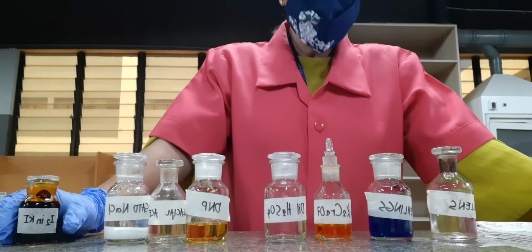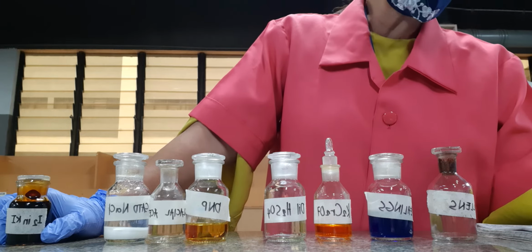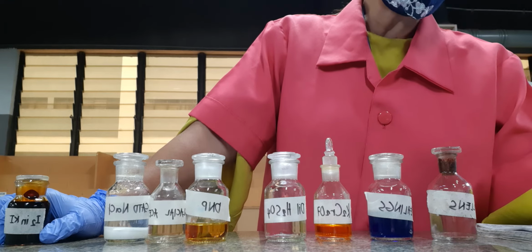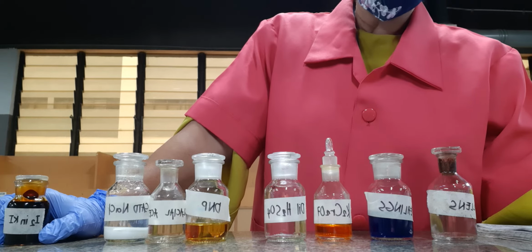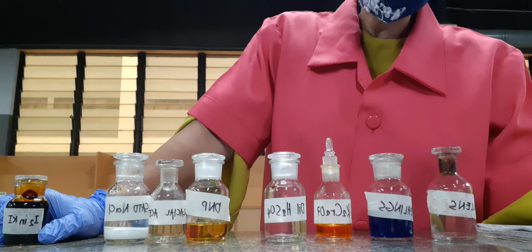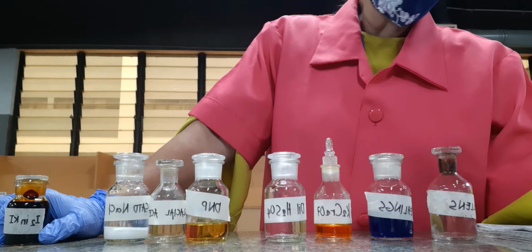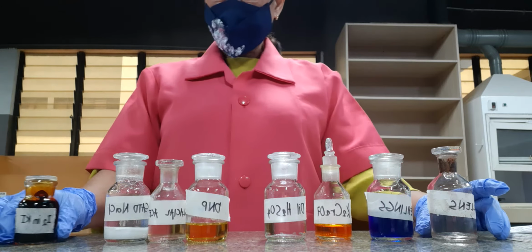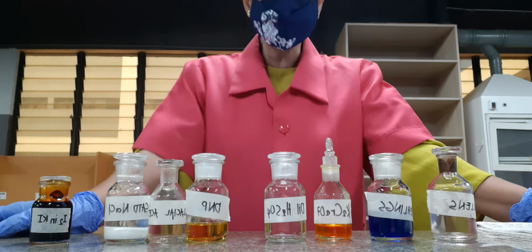So what do you expect? Iodoform is a precipitated substance which is yellow in color, a yellow solid, which we call iodoform. The formula of iodoform is CHI3, or triiodomethane.